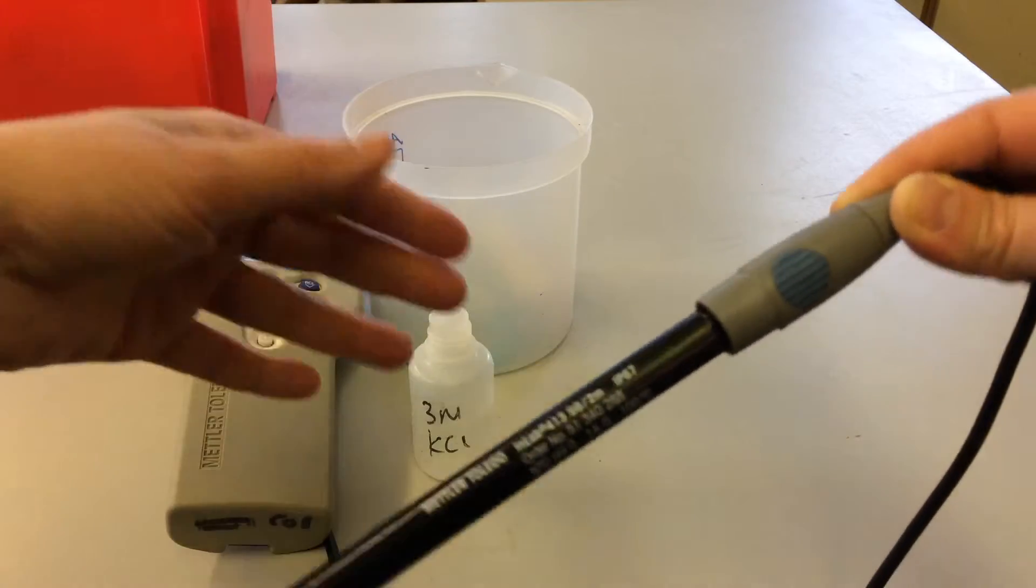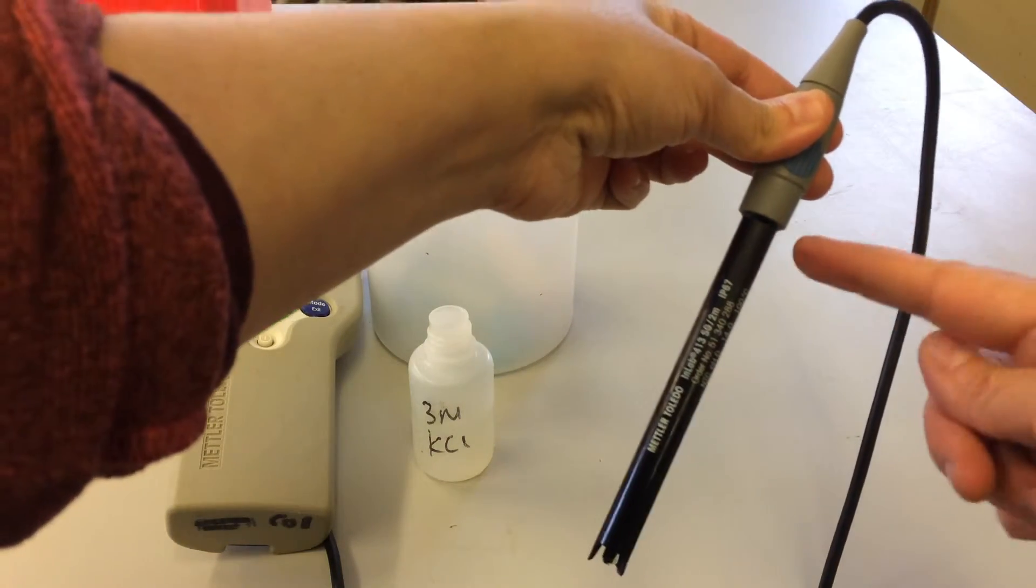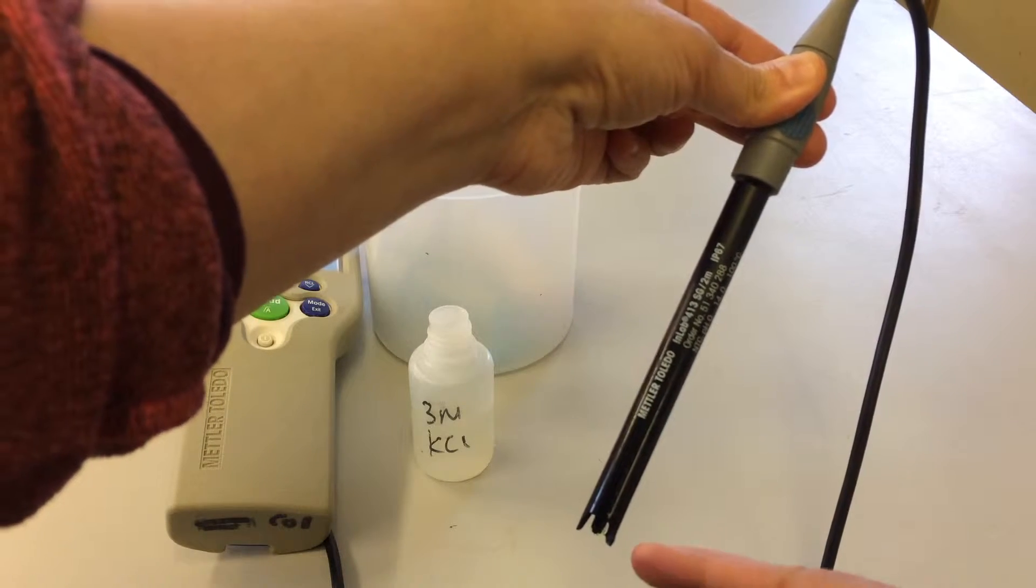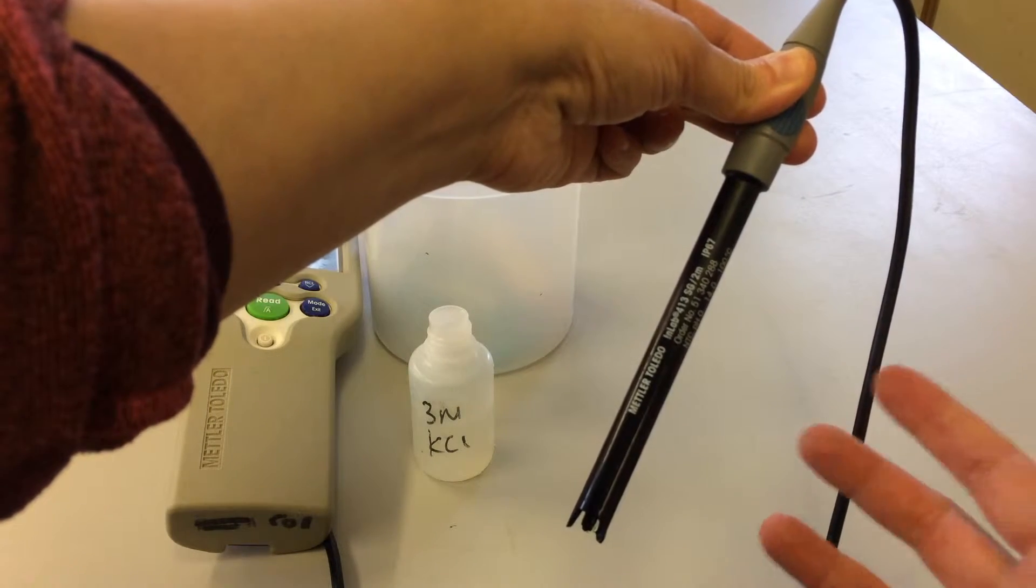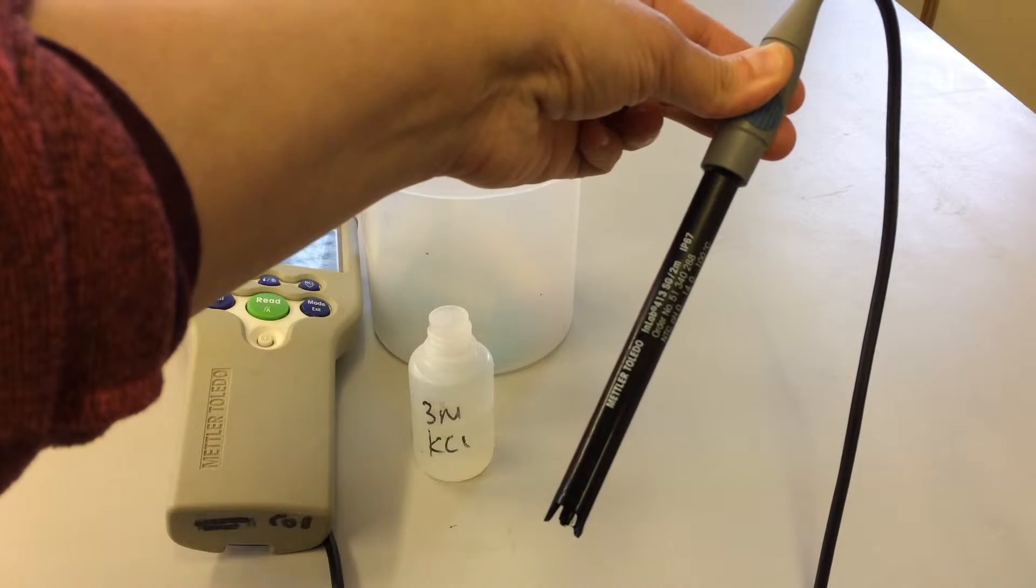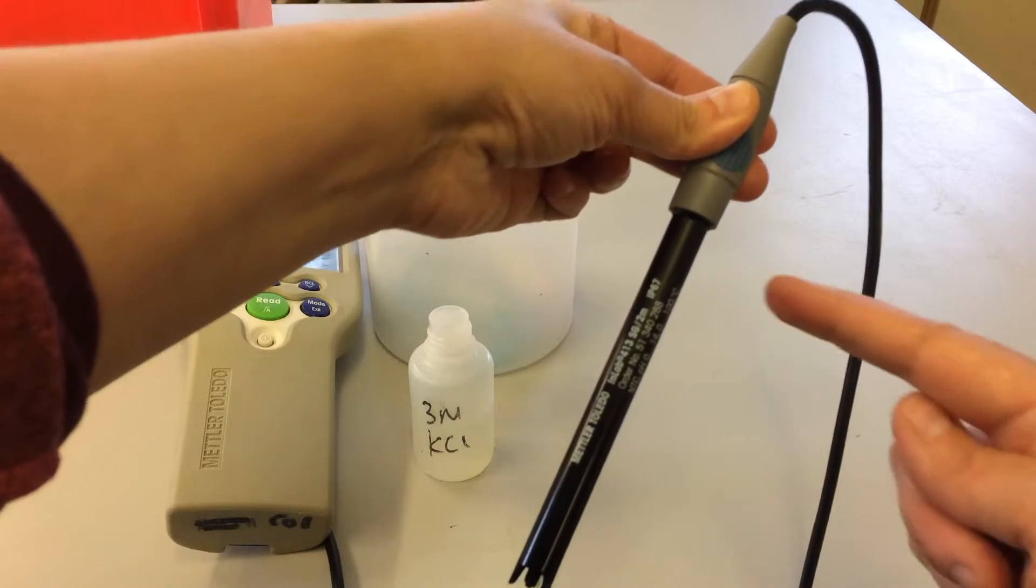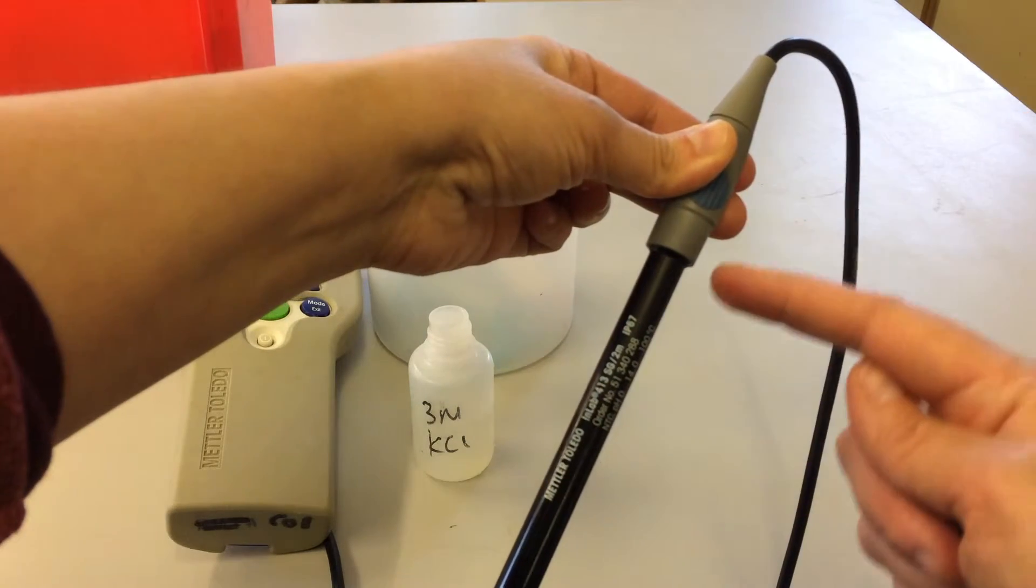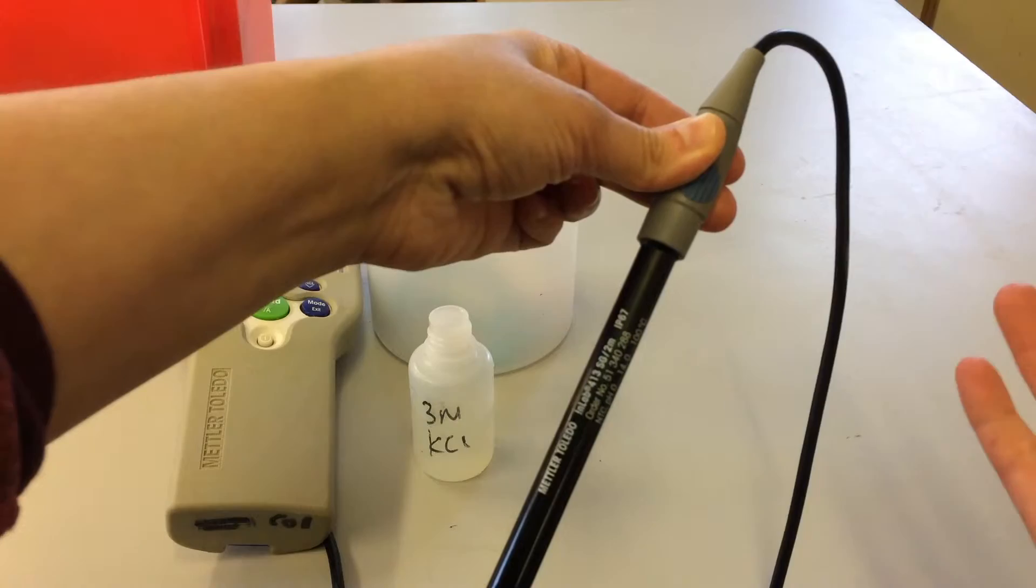Another thing to bear in mind with this probe is that it's not entirely waterproof. This section is, so this is the section that you will be putting into your sample or your experimental tank to measure the pH, say you're doing for example ocean acidification experiments. But this section here, this gray section, is not waterproof, so you must not submerge this underwater otherwise you'll break it.